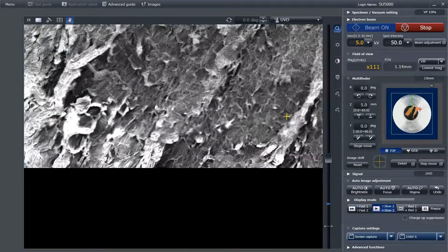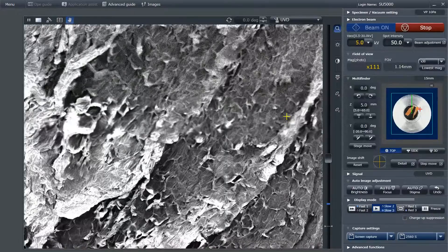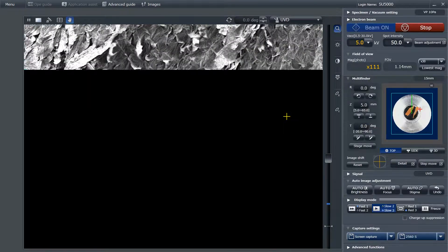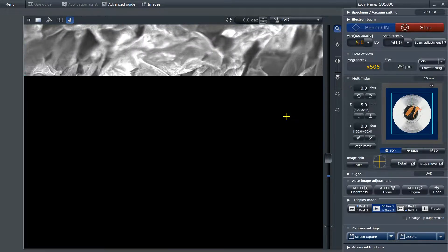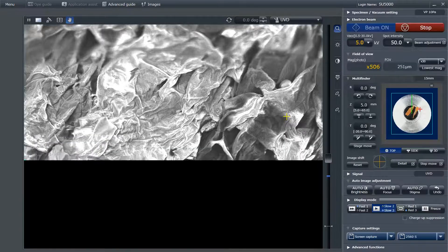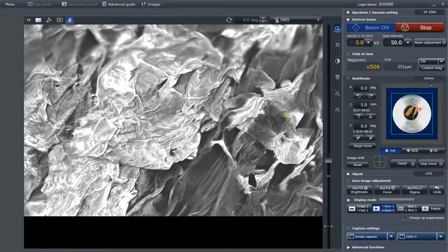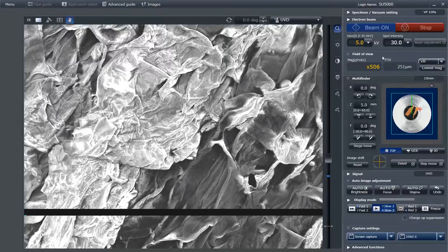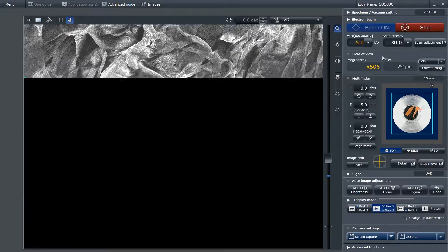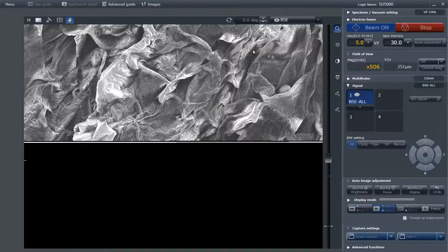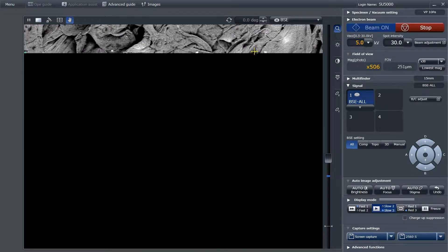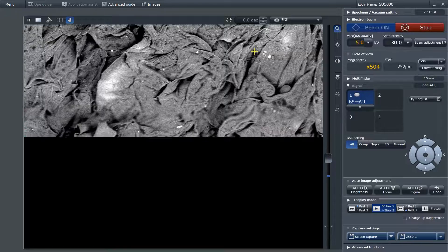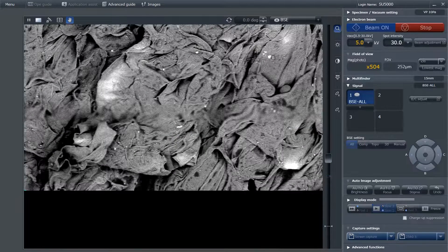Now, after zooming out all the way to locate my position relative to the sample, I've gone to the other slice of carrot. You'll notice from the brightness that it is also charging up quite rapidly. And once again, you'll begin to notice the dark spots appear on the surface of the carrot.